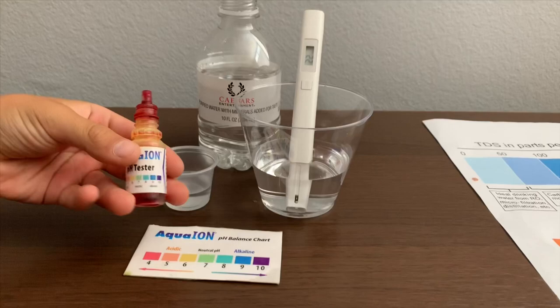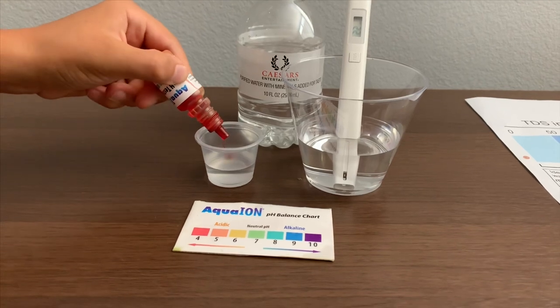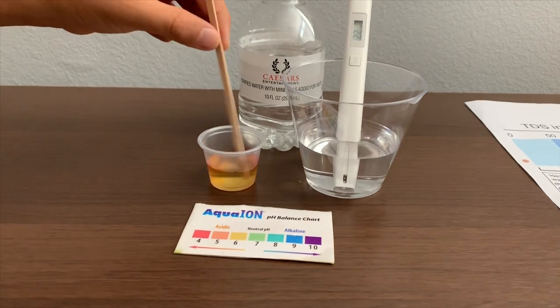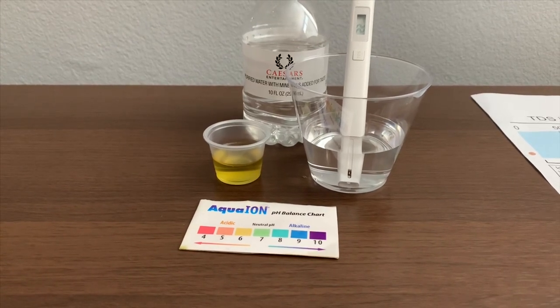Now let's test the pH level. If you want to buy this pH tester, check the link down below. Only do two drops. Let's stir this in a little bit so we'll get a better result. I give this a 6.5. This is neutral pH.